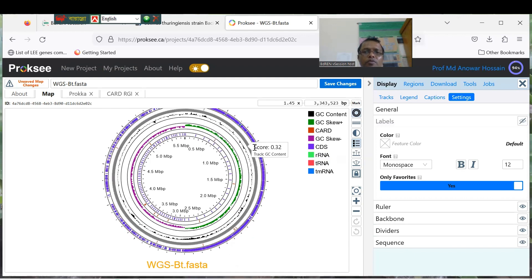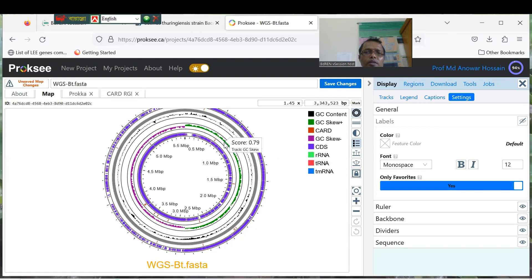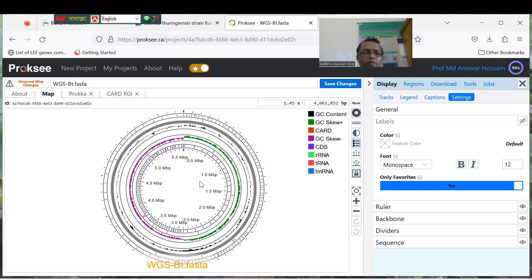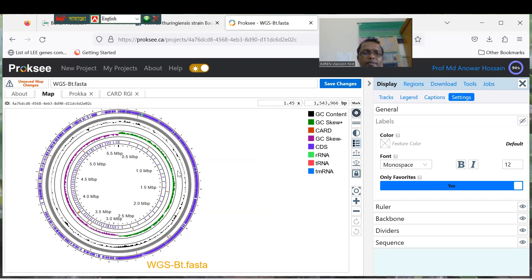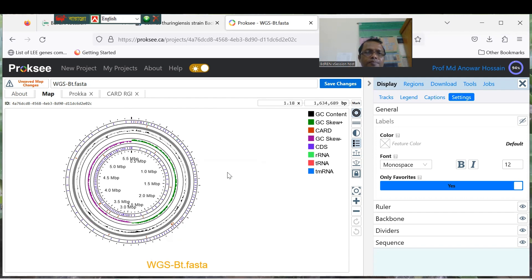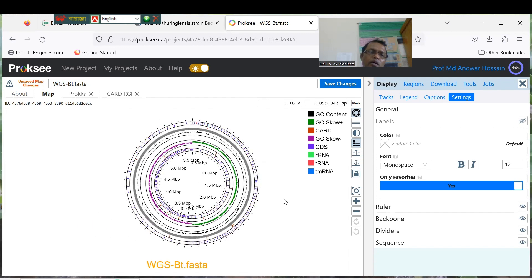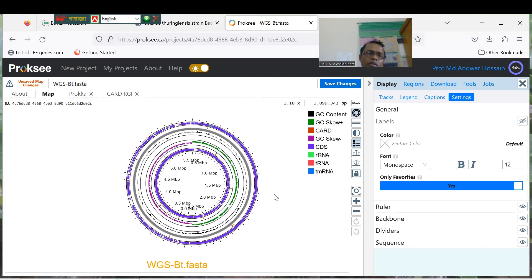This is a very good map. You can see here the coding sequences displayed in blue, and the GC skew layer. This is the map of your whole genome bacteria, and from here you can download the picture.